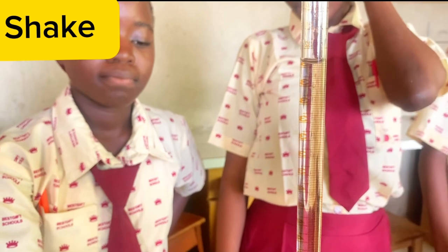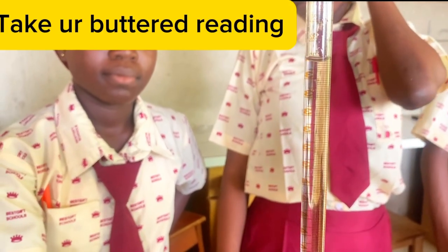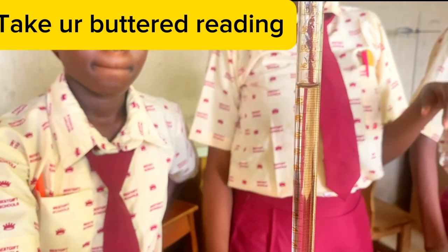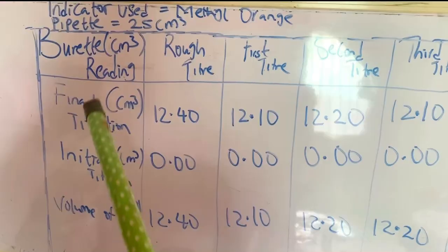And you can see the volume of the acid being reduced from the burette, and that's where we are going to obtain our reading of the volume of the acid used to titrate the base. Color changes next, and then now we present our table.